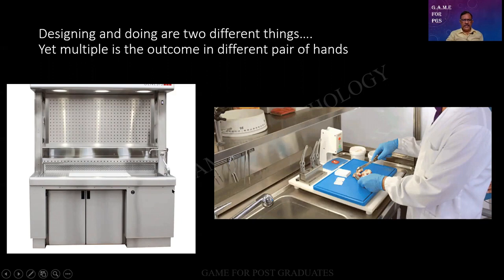A grossing station. These are all newly being designed and we should pay ample attention to all this. Whether there is a flow of water, whether you have got the containers, different sets of instruments are available, and so on and so forth. And then there has to be a grossing table as such, in which we do it. A lot of intricacies are there, which you can learn from each other or from your seniors.